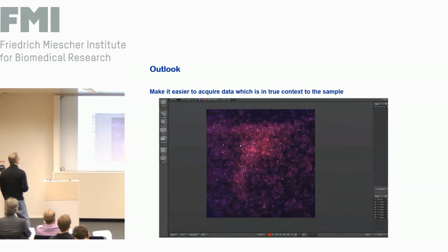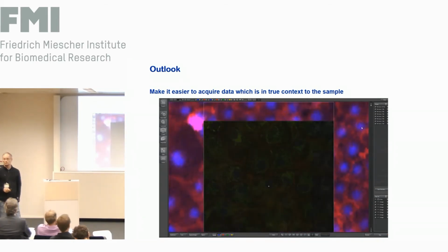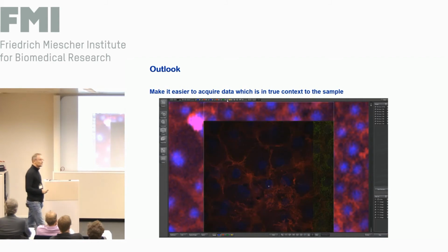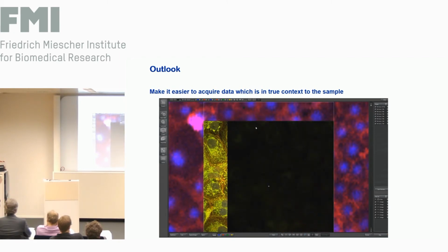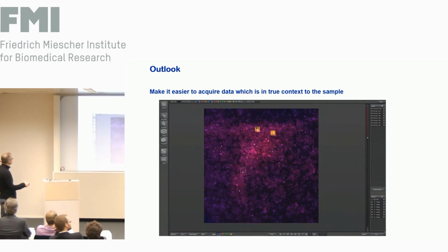Another example is here. This is a confocal laser scanning microscope. And, well, you can generate a nice overview in something like 2 to 5 minutes, a whole cover slip. And then you start your acquisition. So it takes me roughly 15 minutes to generate something like between 30 to 50 3D stacks, manually selected. It's still needed. Not everything is done in high content screening. So you see this little square. You just click in the overview on your images, you go away into your lab, do other work, and the microscope is generating data.